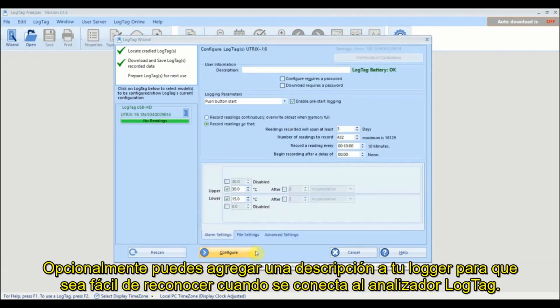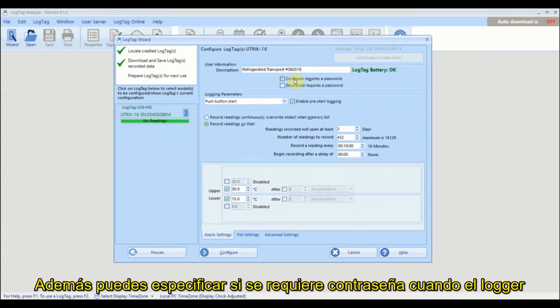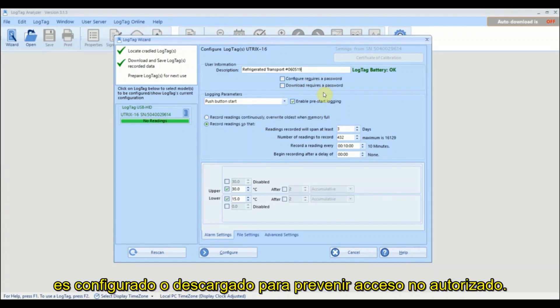Optionally, you can provide a description for your logger so it is easy to identify when the logger is next connected to LogTag Analyzer. You can also specify whether a password is required when the logger is next configured or downloaded, to prevent unauthorized access.